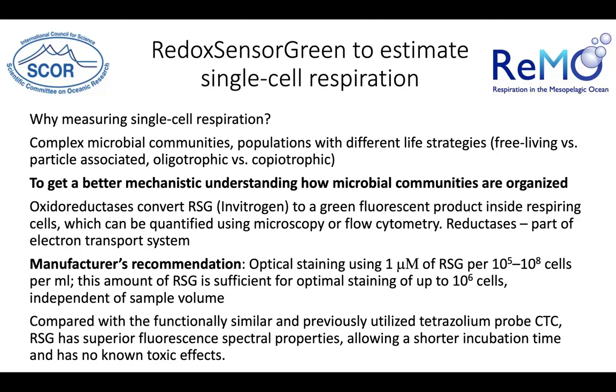So the question is, why do we want to measure single cell respiration when we have all these fancy methods around which have been presented this morning, using Winkler, INT and all the other techniques, and optodes and so on? The idea is that we would like to have an indication of single cell respiration because we have complex microbial communities. We have different populations with different life strategies.